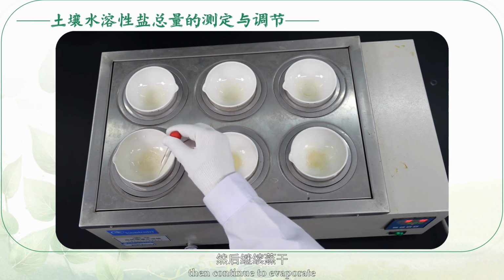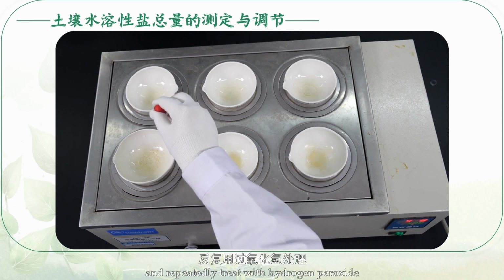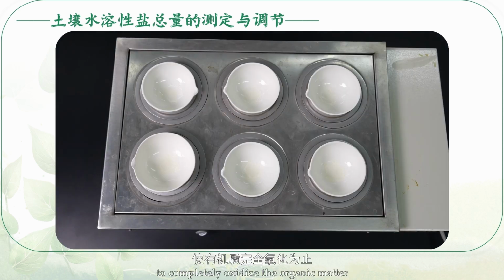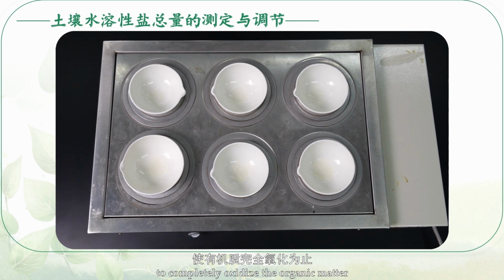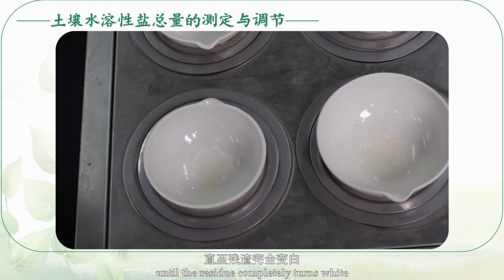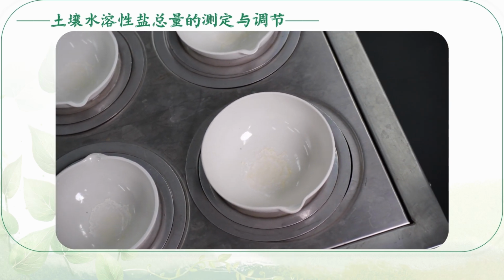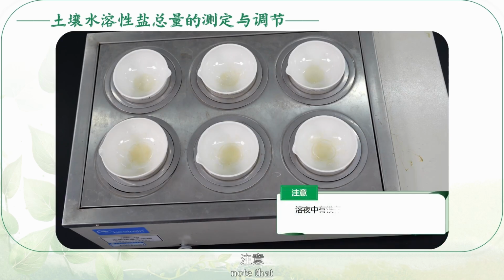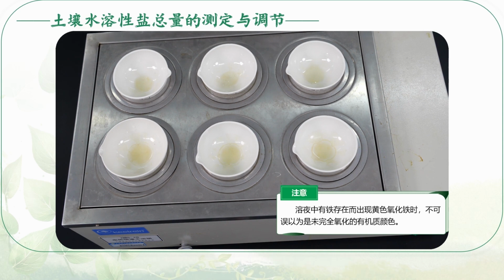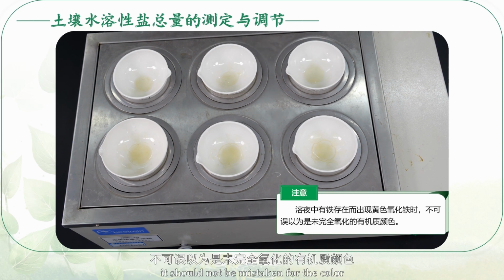Then continue to evaporate and repeatedly treat with hydrogen peroxide to completely oxidize the organic matter until the residue completely turns white. Note that when there is iron in the solution and yellow iron oxide appears, it should not be mistaken for the color of incompletely oxidized organic matter.